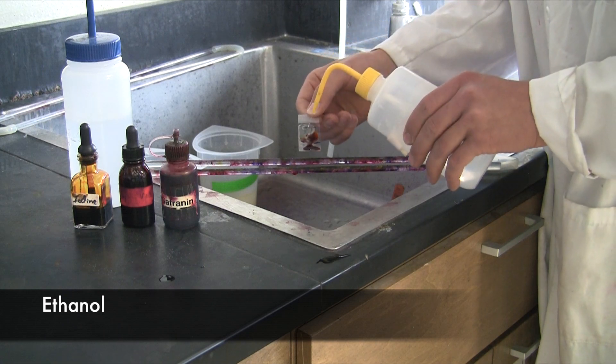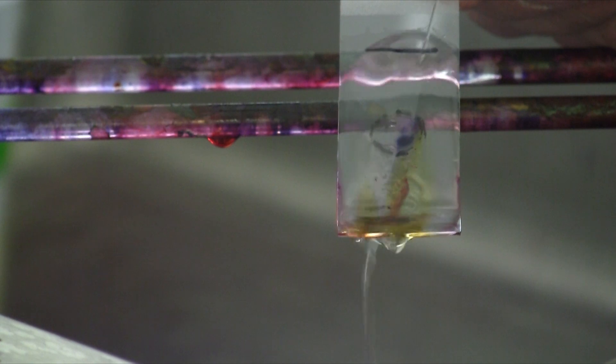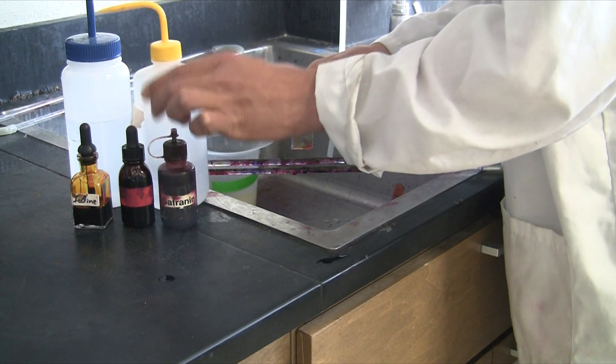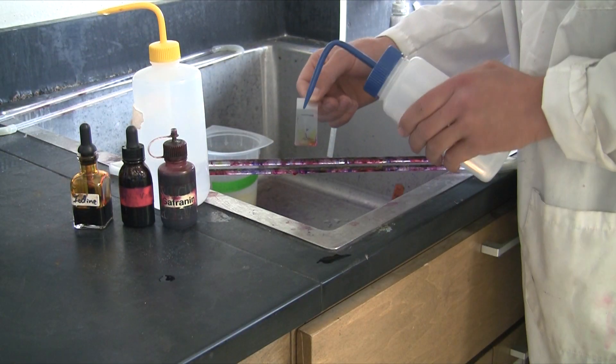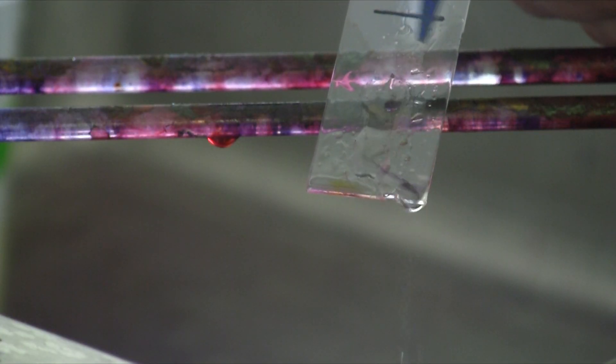This can then be rinsed in the most artsy step of all of the Gram stain, the ethanol step. Rinse just until the runoff is no longer colored and then immediately switch to water. This takes a while to get used to. It's a tricky step.